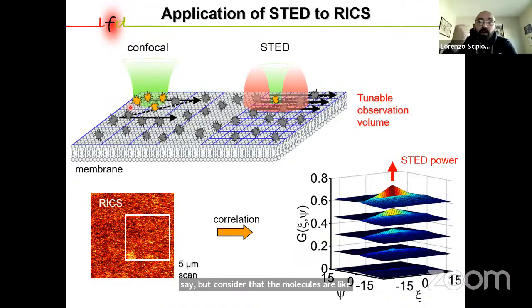And if you have a sample at a very high concentration, then the fluctuation will be really, really small, and you won't get a clean readout. With STED, we're effectively exciting much fewer molecules, because in volume, going from 300 to 50 is a lot fewer molecules excited.